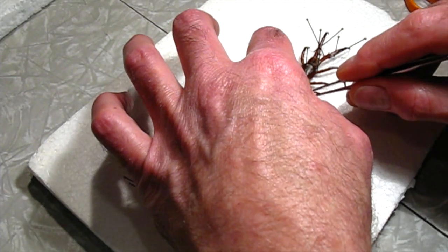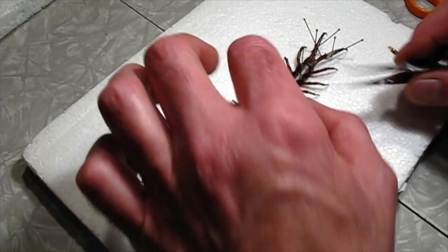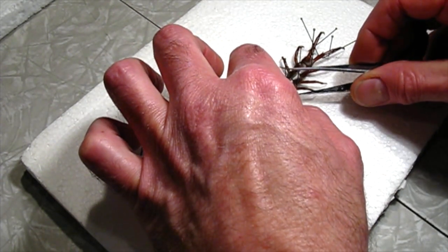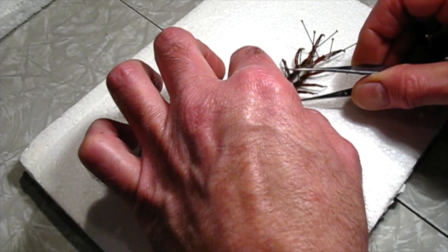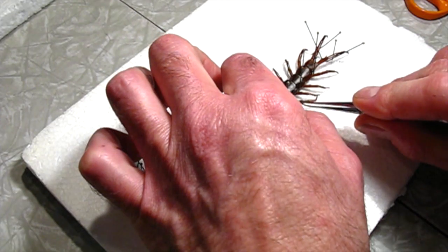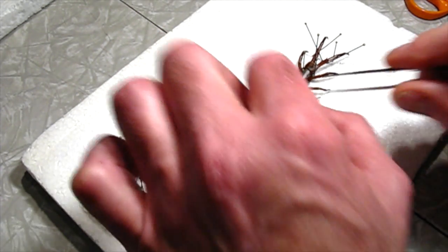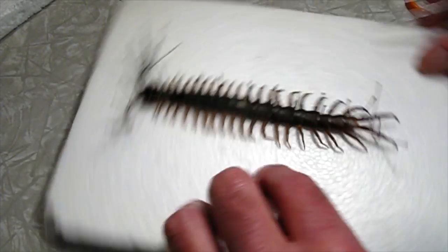Really get it in there. It's having trouble going in. I'm going to try and open up this hole a little bit. Oh yeah, that's better. Okay. Now I'll insert this in. Yeah, that's better. And then get that leg in the right position.